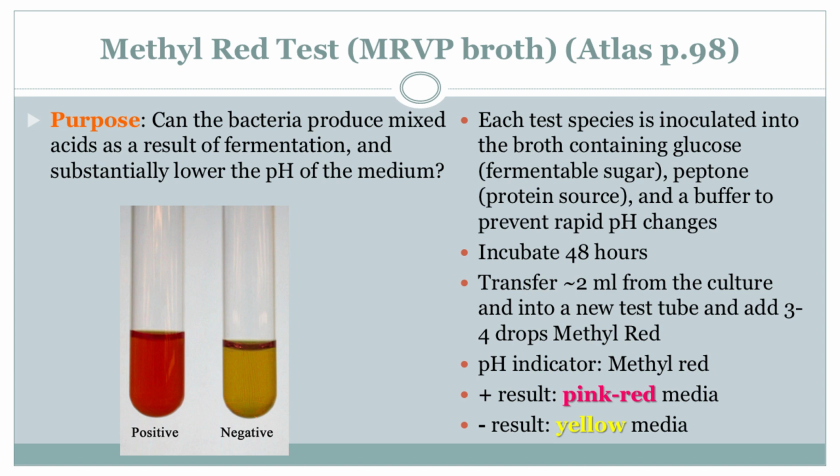And this isn't just a fun fact. Knowing the difference in the ways they metabolize actually has some very important implications. I bet. That's what I love about these deep dives. We start with something seemingly simple, like a color-changing test, but it always leads to a bigger conversation about how these bacteria actually affect us in the real world. Exactly. And that's really where the methyl red test becomes important. It might be a simple test, but it tells us so much. Maybe we should spend some time digging into those real-world implications. What do you think? Definitely. Let's connect the dots between that red color change and why it matters for us.